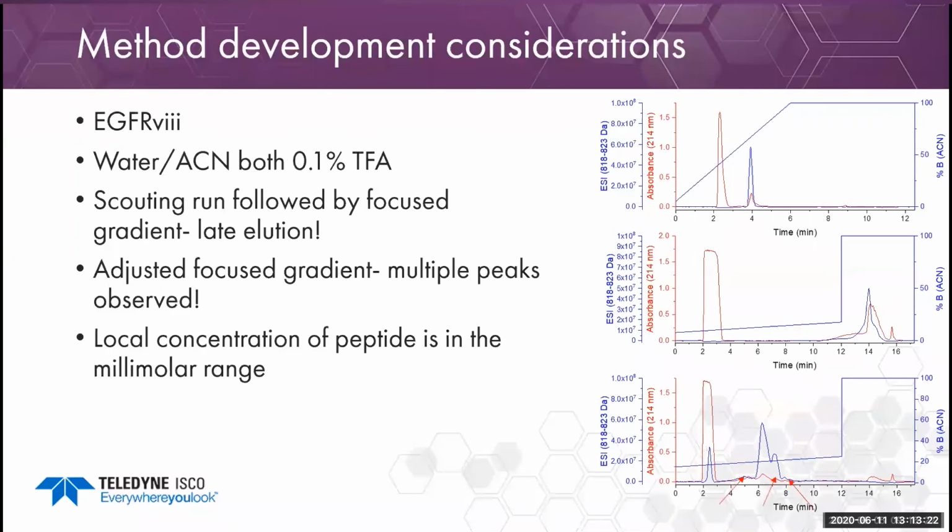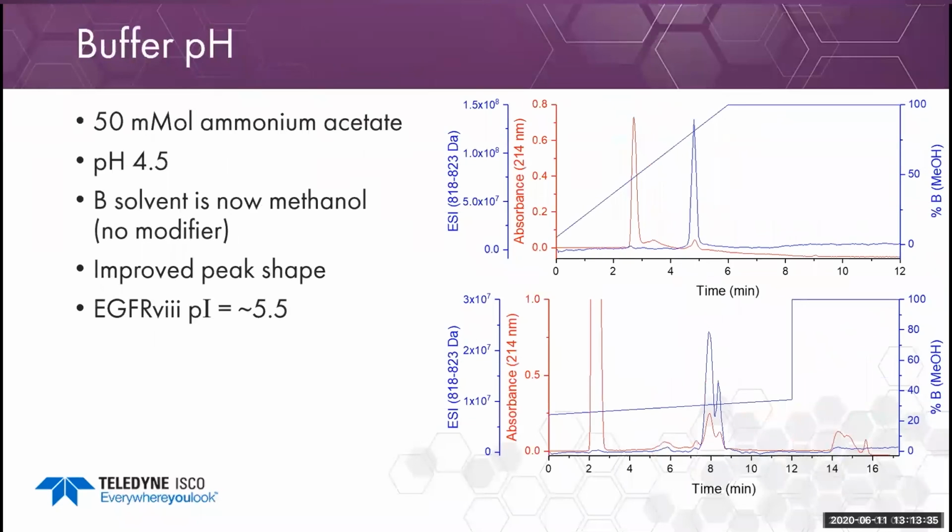Without the mass spectrometer, one might think that the other peaks were impurities. These peaks might not be collected, so that material would be lost and your yield would be lowered. Let's try a buffer, but now I need to make some changes to my solvent system.